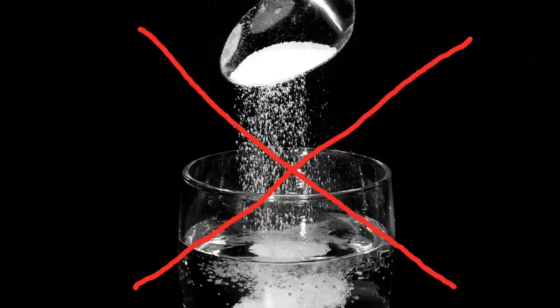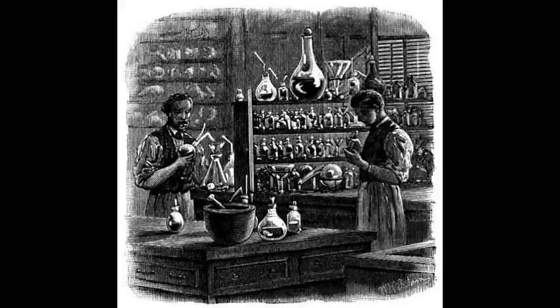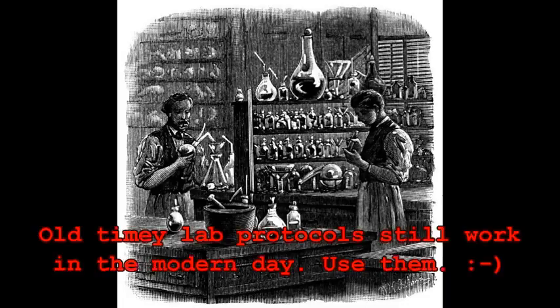And to top it all off, sodium bismuthate is one of the rare water-insoluble sodium salts. It is virtually insoluble in cold water and has limited solubility in hot water. This was the basis for an old gravimetric test used to determine the quantity of sodium ion in a solution. Although in professional labs this test has been superseded by superior technology, it is still a viable tool for the home chemist. Gotta be creative, people.